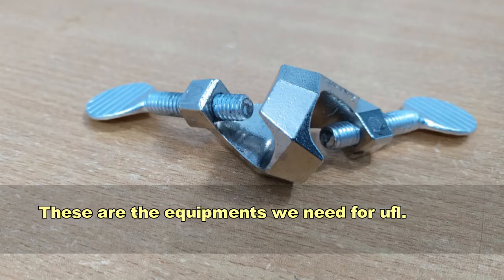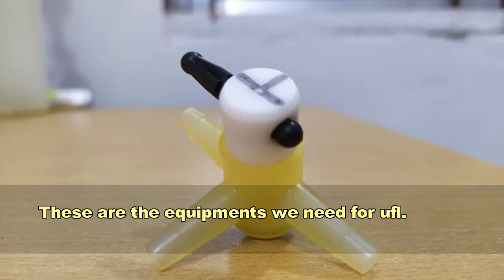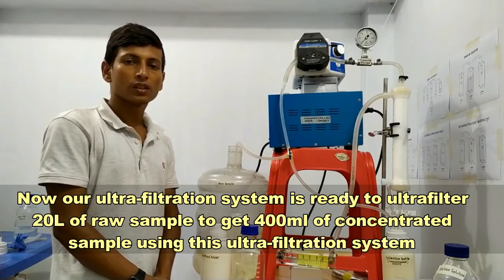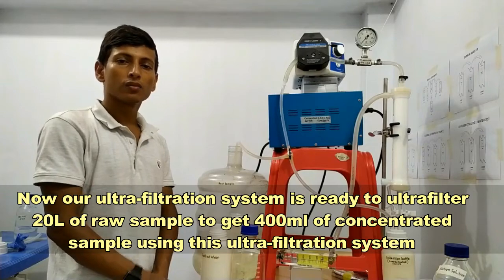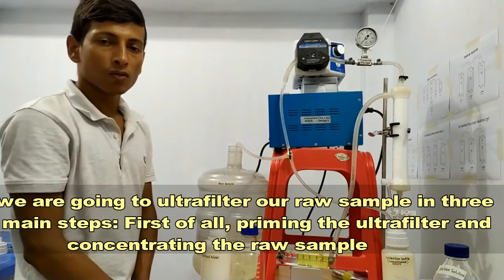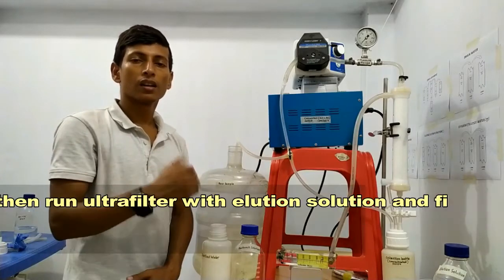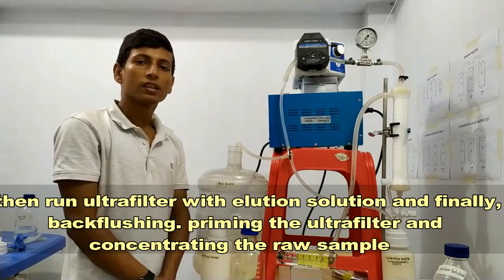Boshir will introduce you to how to do this cycle and how to run the ultrafiltration. Our ultrafiltration system is ready to filter 20 liters of raw sample to create 400 ml of concentrated sample. We are going to ultrafiltrate the raw sample in three main steps: first, priming the ultra filter and concentrating the raw sample; then running the ultra filter with elution solution; and finally, back flushing.